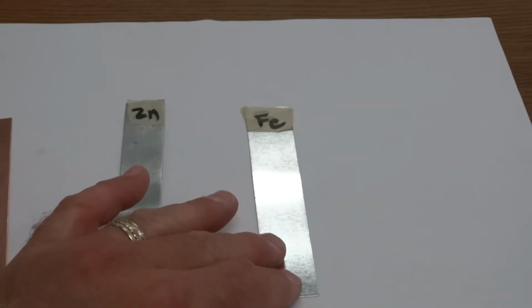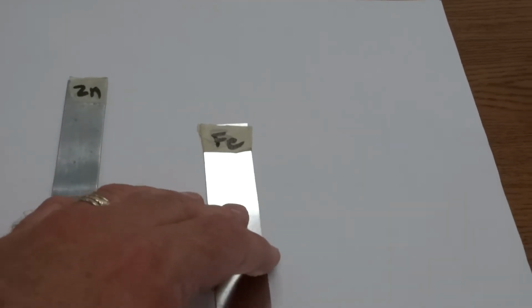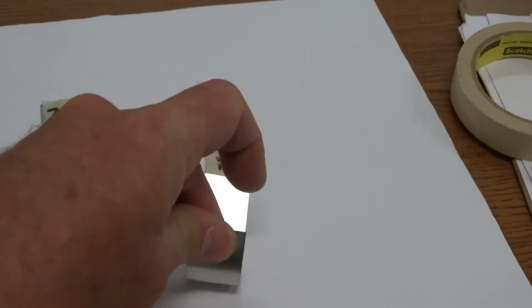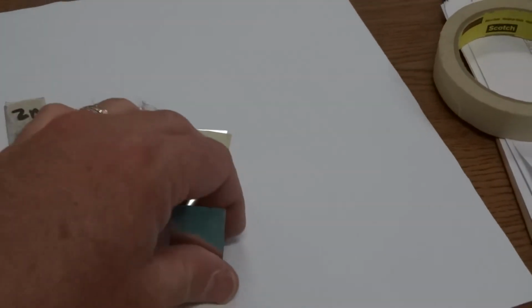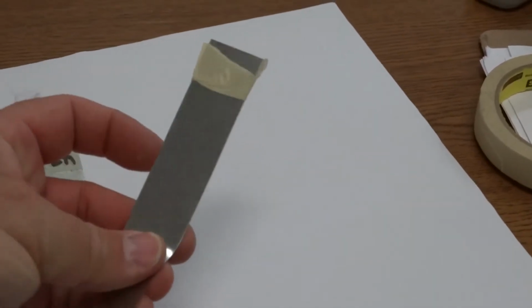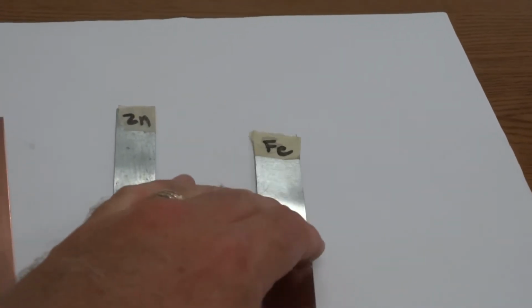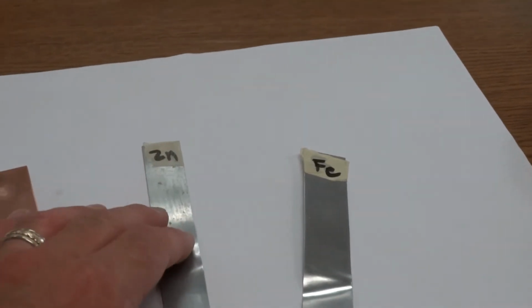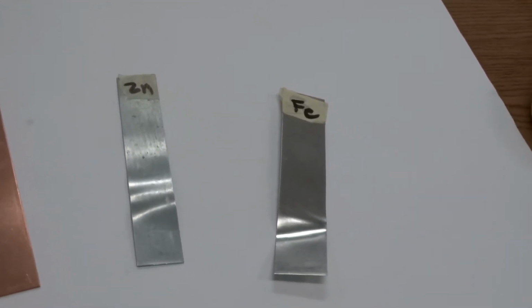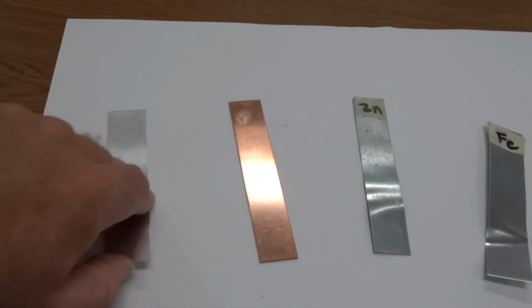Now the last item here is iron. The chemical symbol for iron is Fe. Let's see if that works. Iron as well bends. It has malleability. Iron, I would say, just by testing its malleability, has a little bit more rigidity than the zinc has, and it does not have as much.